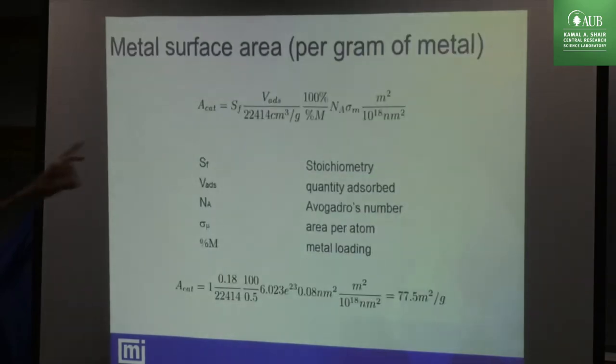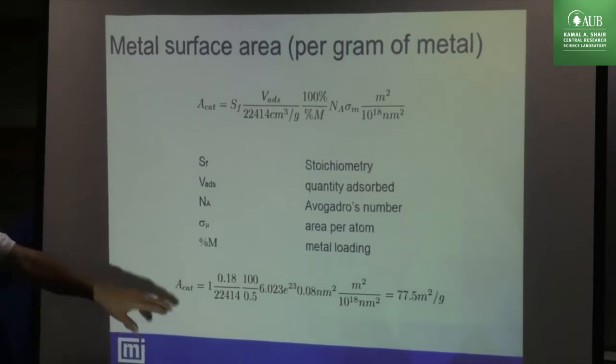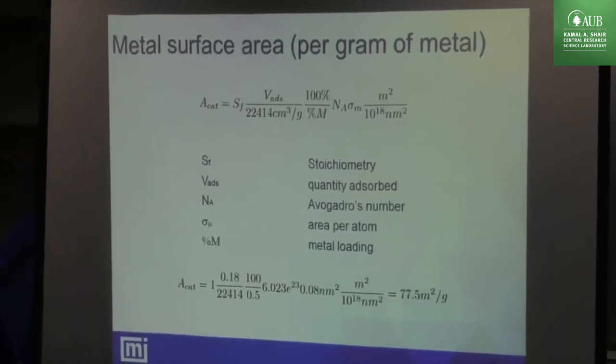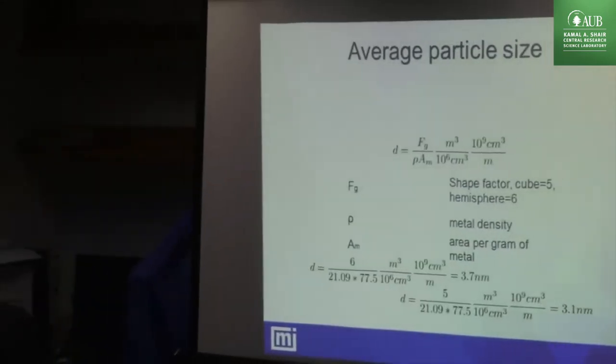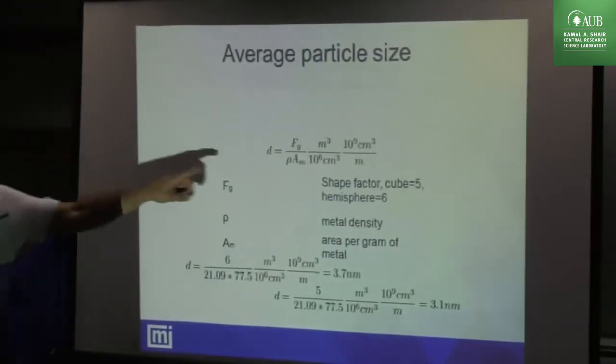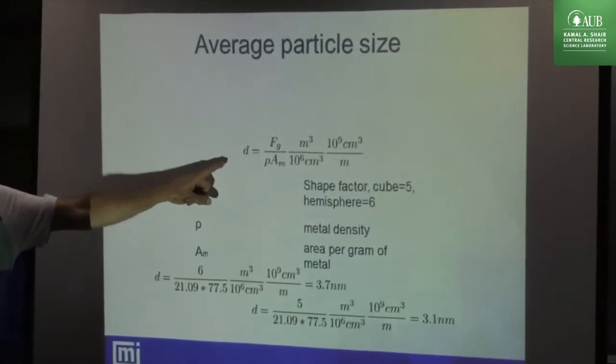After we do chemisorption, we measure the active metal surface area. Again, it's very, very important. As I said, this is the area where the reactions take place. The higher the active metal surface area, the higher will be the activity of the catalyst because we have more surface where the reaction is taking place. Okay? So also we can have this. This is a formula. As I said, you're going to have this presentation also in the book. These equations, and the last one is the size of the active particles, D, okay?